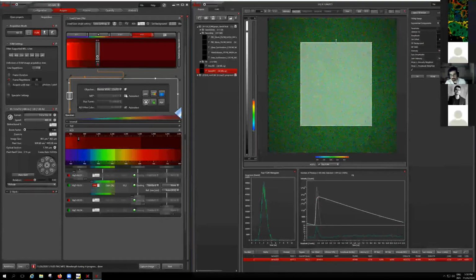We are using auto select so that it matches the best for the measurement we want to do, but we want to make sure it's not changing from experiment to experiment. So usually in the metadata I check and make sure that the auto select is selecting exactly what we want. And also, from 1 to 3, the chi-square.